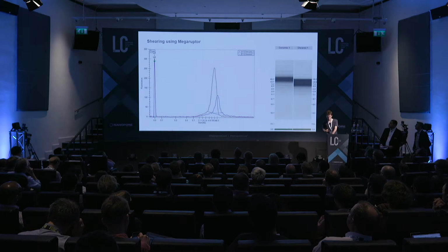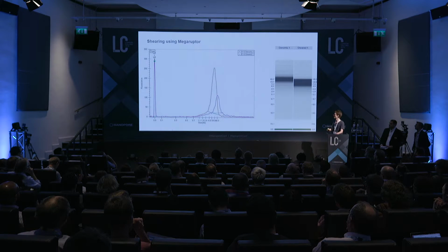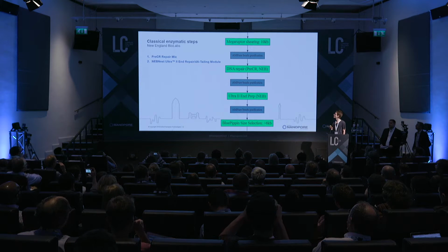With the sizes, you can see in blue here the unsheared sample, in red the sheared sample with a nice peak on 10 kb, which is what we wanted to shear for. Then after shearing, I performed the classical enzymatic steps, nothing really new here.